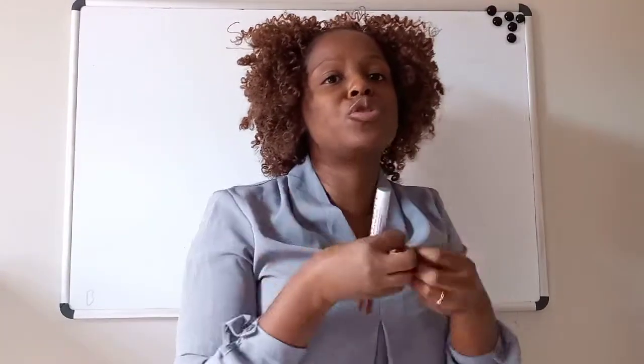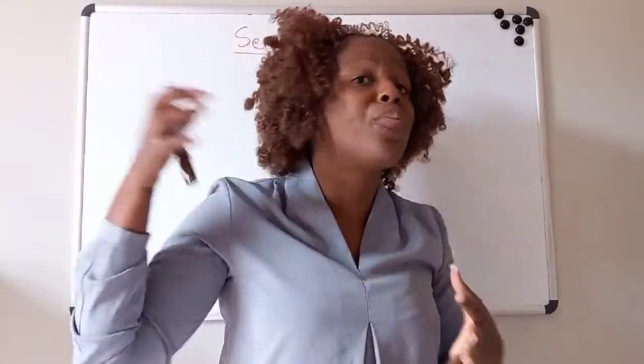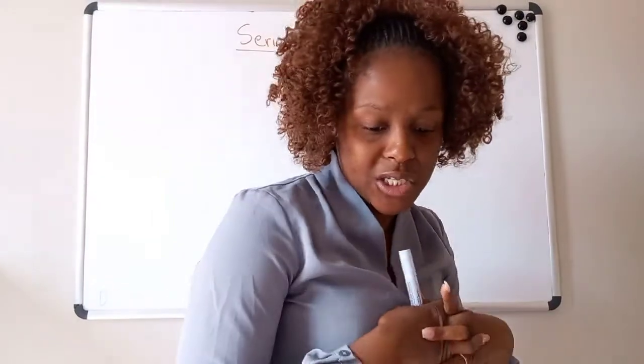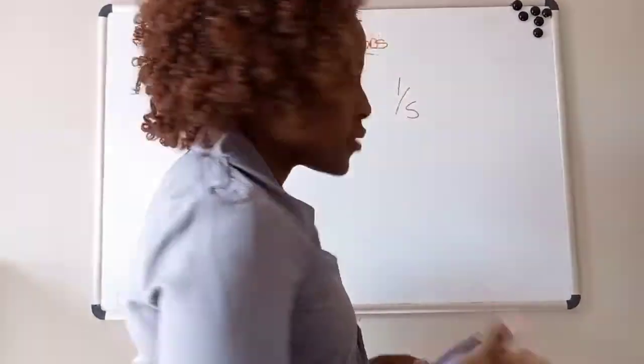The reason why we do that, like I said, is to try to minimize or rule out human error, to make sure that whatever result we are reporting is a correct result, because a lot of things, like pipetting technique, can also affect your dilution result. So that's why it's very important every time to calculate the percentage difference from the two results. So let's have an example.